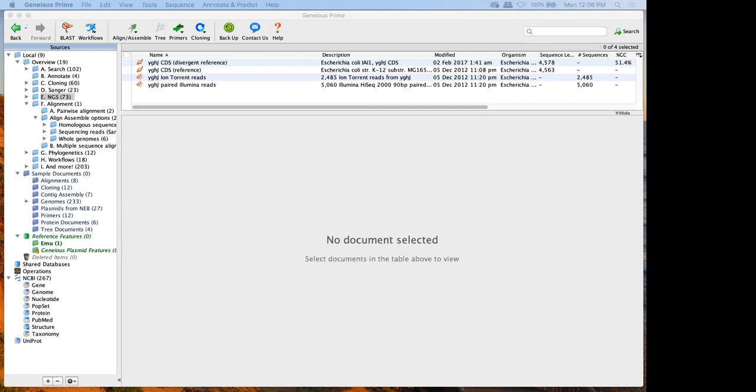So if your sequencing provider has already done some pre-processing, skip over those steps in Geneious. If you've already aligned your sequences somewhere else, so you've got a BAM file instead, then just import that BAM file straight into Geneious. You don't need to rerun or redo work necessarily within Geneious. So you could go straight from a BAM file to the visualization and do your SNP calling.